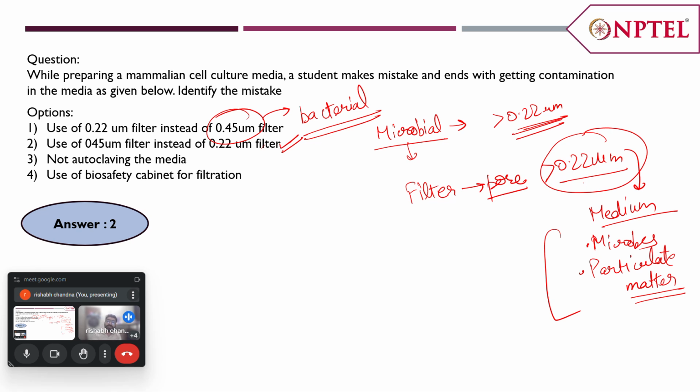Actually, mammalian cell culture is sensitive towards anything. If we do not disinfect or sterilize the surface itself, it can cause contamination to the mammalian cell culture. Even a small fungal or bacterial colony growing inside your tissue culture room would cause a hazard to the cell culture area. All the culture plates can be destroyed in a minute.